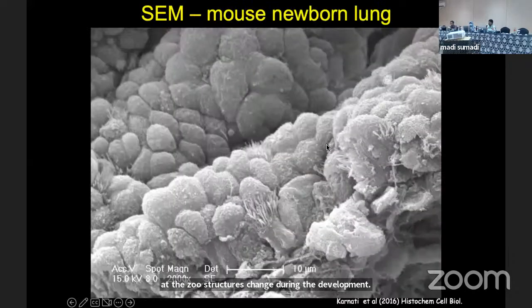It's very interesting. It's a newborn lung. So we see it from the structural point of view. And you see the nice terminal bronchioles, part of the conductive part of the lung. And then after comes the respiratory part. The end part is where the structure changes, because the gas exchange comes from outside to our trachea, the bronchus, then the bronchiole. The terminal bronchioles actually end there, and then comes the respiratory part with the alveoli. This is a kind of junction where the function of the part changes.